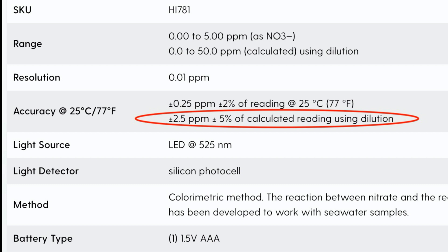So the NIO test kit said 5, the first HANA test said over 5, and the third HANA test said 4.8, which is all what you'd expect to see based on the margins of error. It was nice to see that the NIO test kit was giving me the same answer as the HANA.